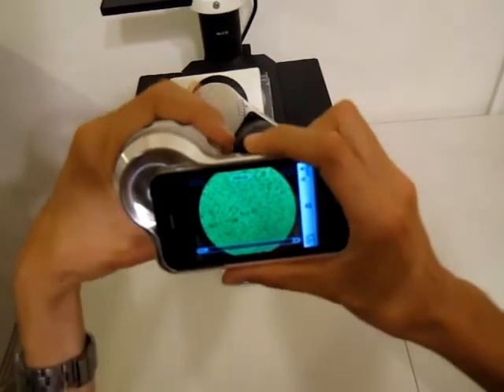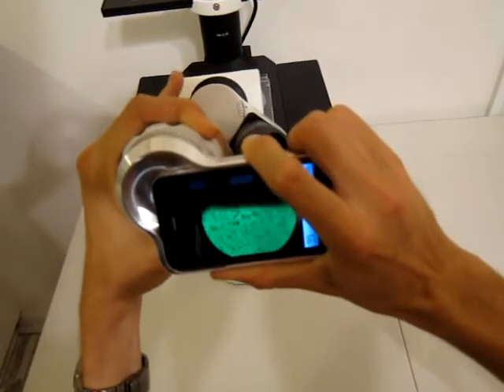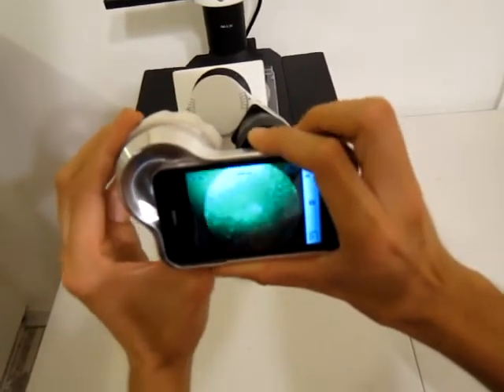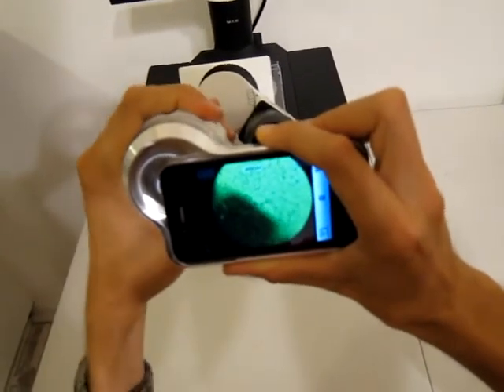And that's it. When you want to take it off, just grab the case and untighten it to remove it. But don't untighten it all the way — just untighten it enough to remove it, so it makes it easier to slip on the next time. So you can slip it on easily again.